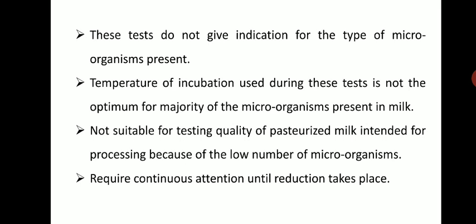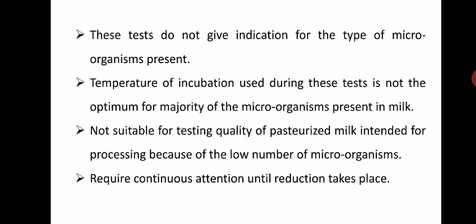Basically, this test is a qualitative test. The temperature of incubation used during this test is not the optimum for the majority of microorganisms present in milk. This test is again not suitable for testing the quality of pasteurized milk intended for processing because of the low number of microorganisms. And this test requires continuous attention until reduction takes place. So these are the drawbacks, and here we have finished the Resazurin reduction test. Thank you.